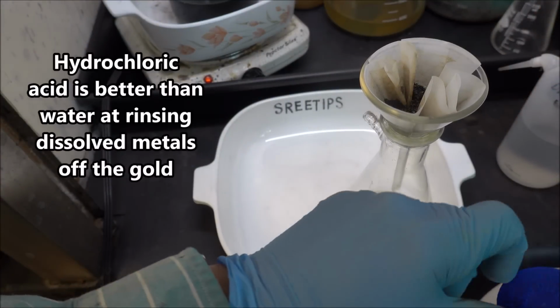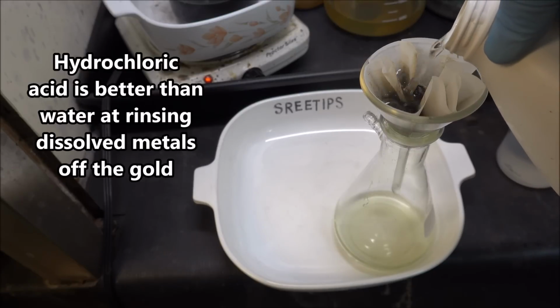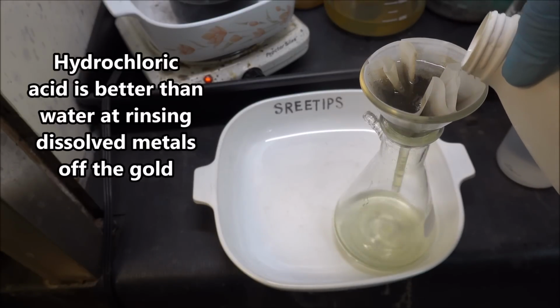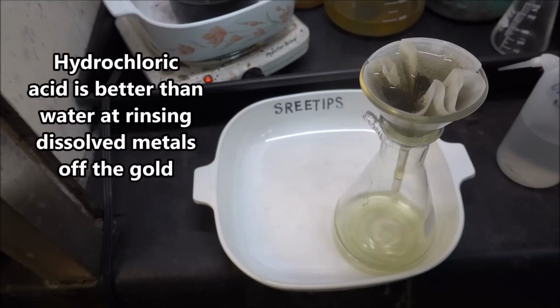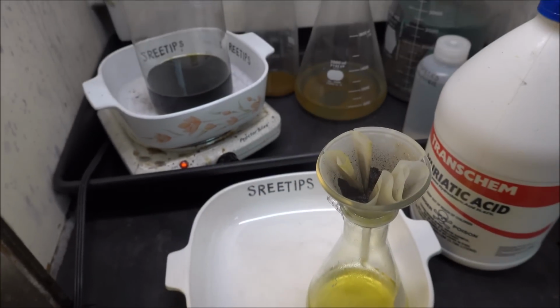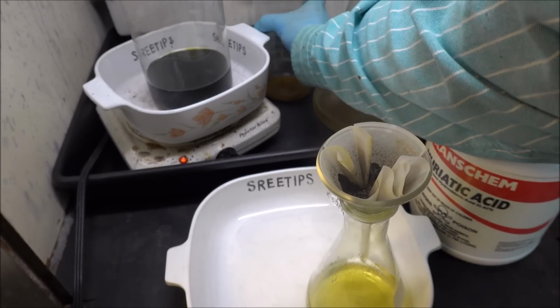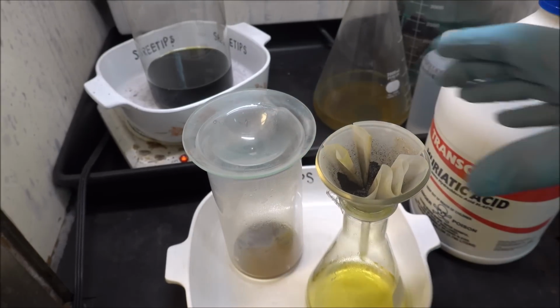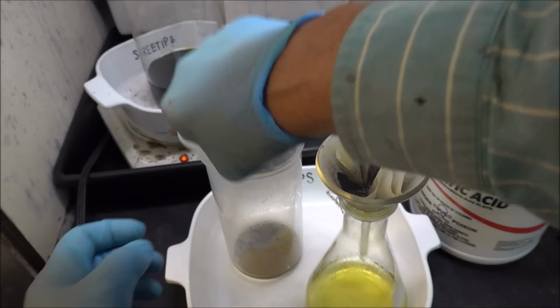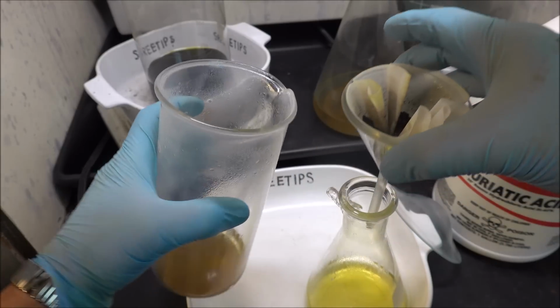Alright, here's our gold that we got in our filter. I'm going to pour a little bit of hydrochloric acid in here to try to rinse some of the other dissolved metals off of it. Alright, I'm going to take our gold from back here now, and we're going to bring that up forward. I got a little bit of hydrochloric down in here, so we'll pour this off into a waste container here.